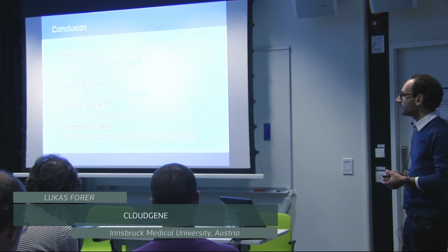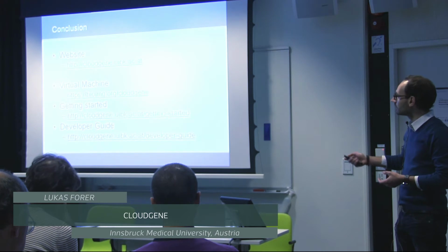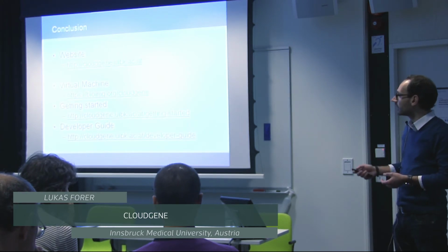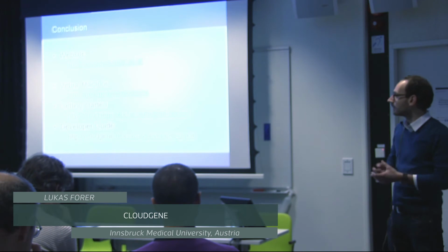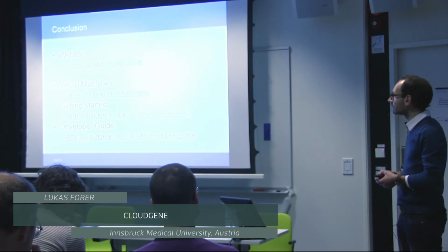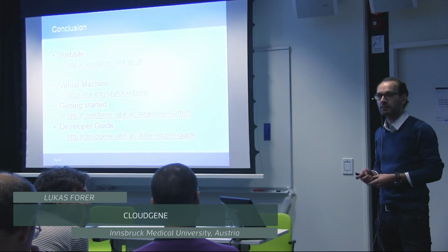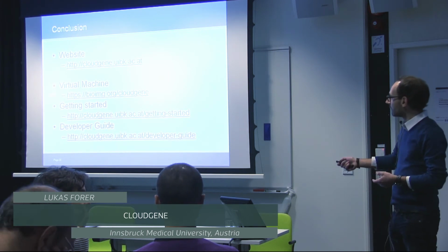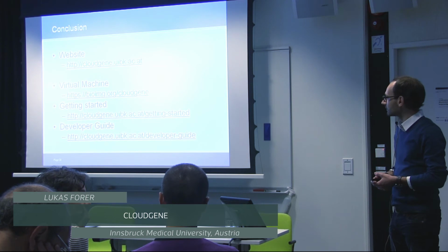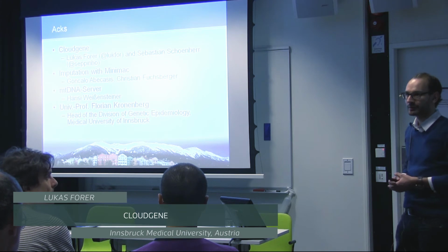So I'm at the end of my presentation. If you are interested in CloudGene, you'll find here the website with some information. We have also created a virtual machine for this workshop which can be downloaded here. If you attend the tutorial this afternoon, you can download the virtual machine, and then we can show you how we are using CloudGene in our analysis of NGS data. We also have some documents to give you a smooth start in CloudGene. So thank you very much for your attention.